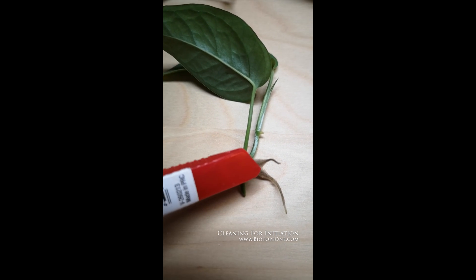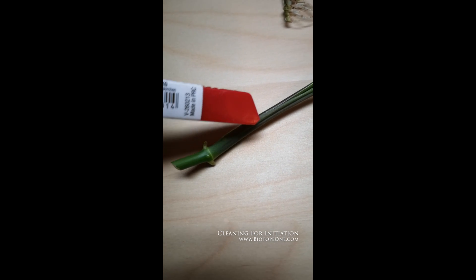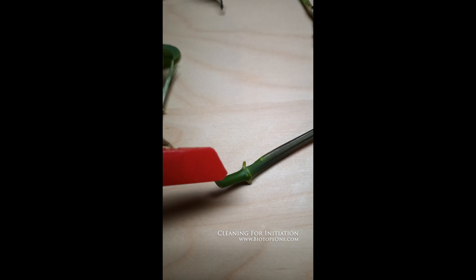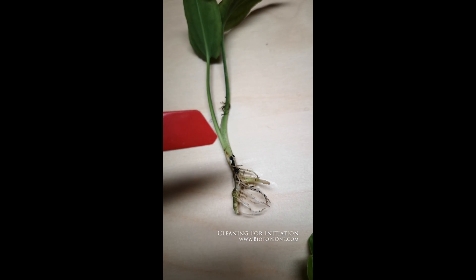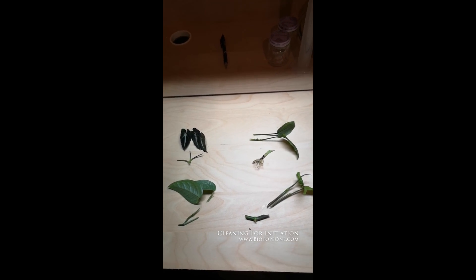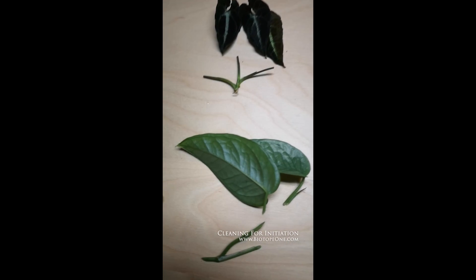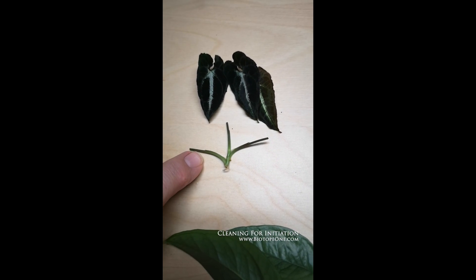I'm going to cut these little exploratory roots off and cut this back here. When you cut it, you want to leave a little bit extra so that you can trim it — about five millimeters or so — just to make sure that you don't kill your explant. You can see what I've done: trim off the excess but leave enough so that you don't get any capillary action with the bleach killing everything.